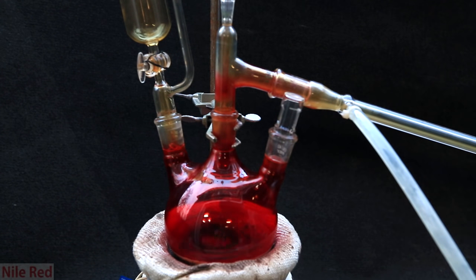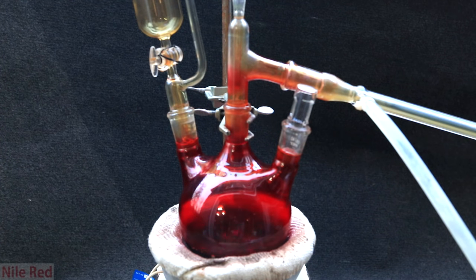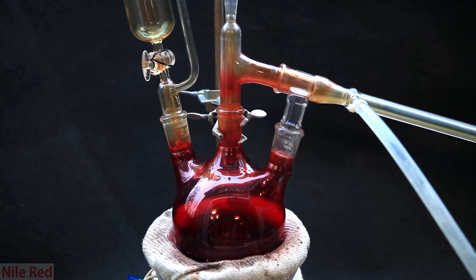Eventually, the stir bar isn't stuck anymore, and it starts to work. As we begin to heat, and more chromal chloride comes off, the flask will get darker and darker until it's pretty much black.